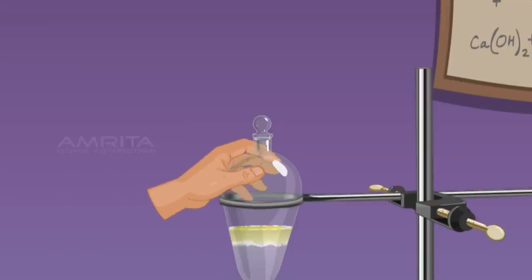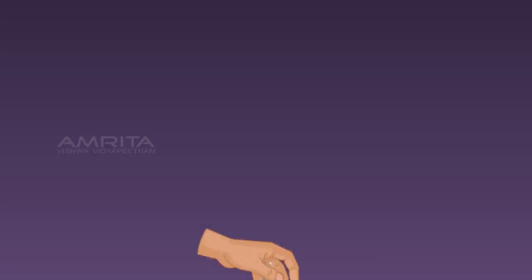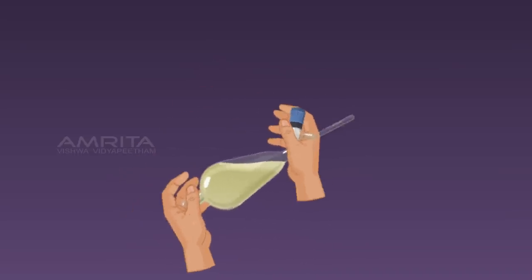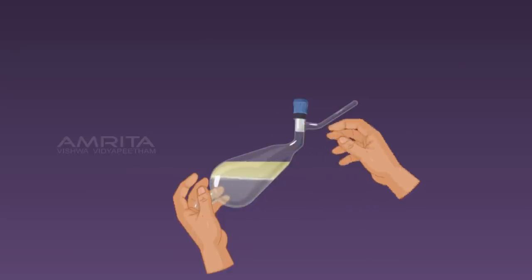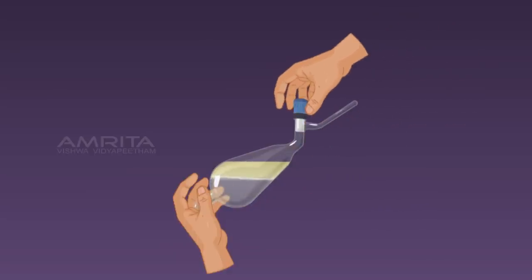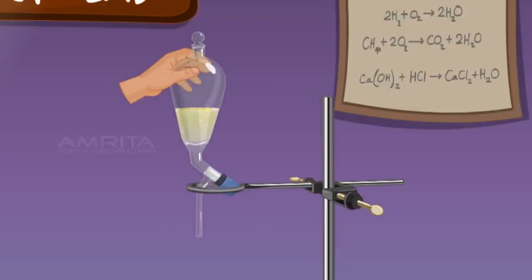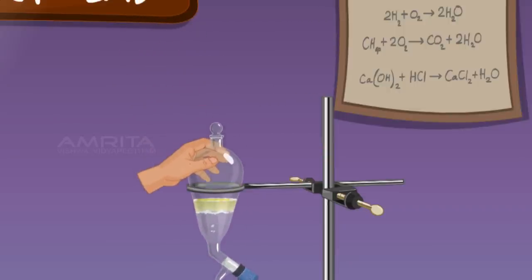Take the separating funnel from the stand. Invert the funnel and shake it gently and slowly open the stopcock of the funnel to release the pressure inside the funnel. Place the separating funnel in the stand and allow the two liquids to separate completely.